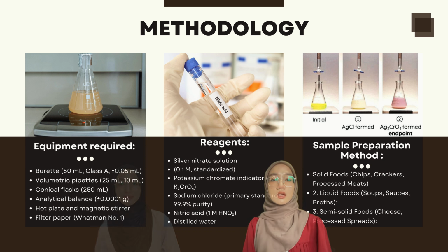There are 3 sample preparation methods used in this experiment. Firstly, the preparation method for solid foods such as chips, crackers, and processed meats.